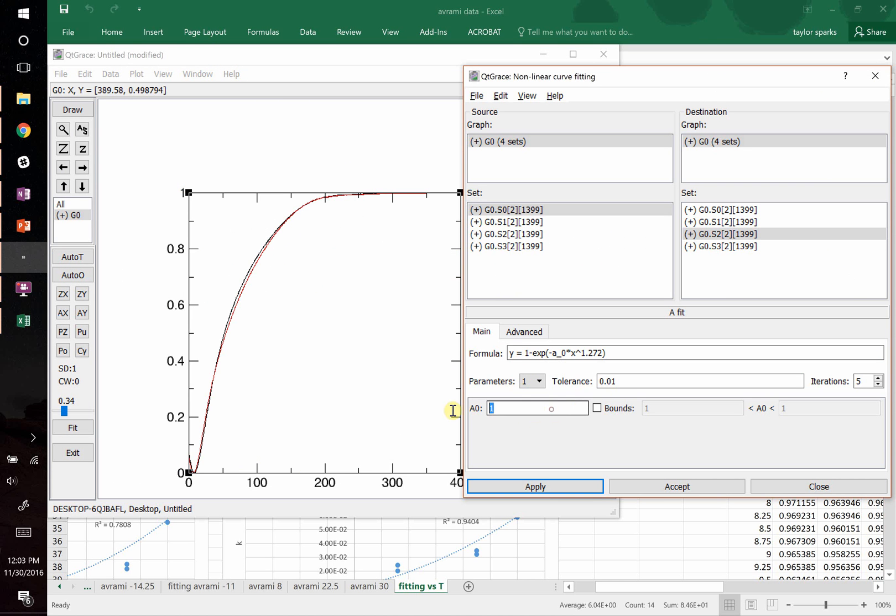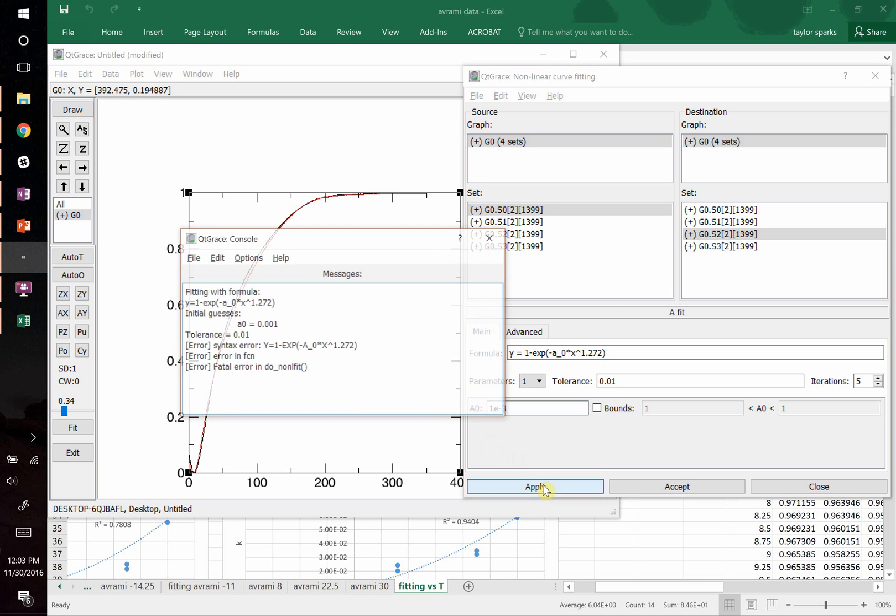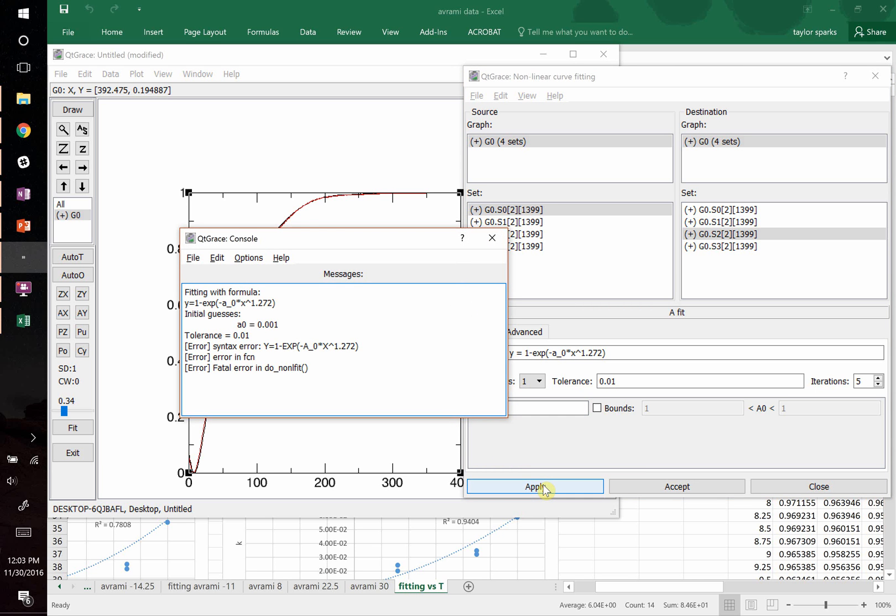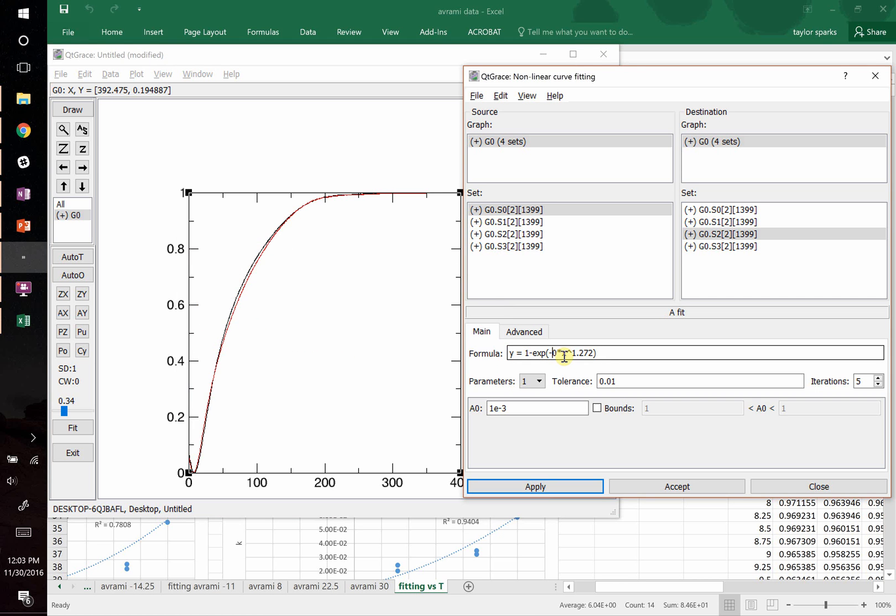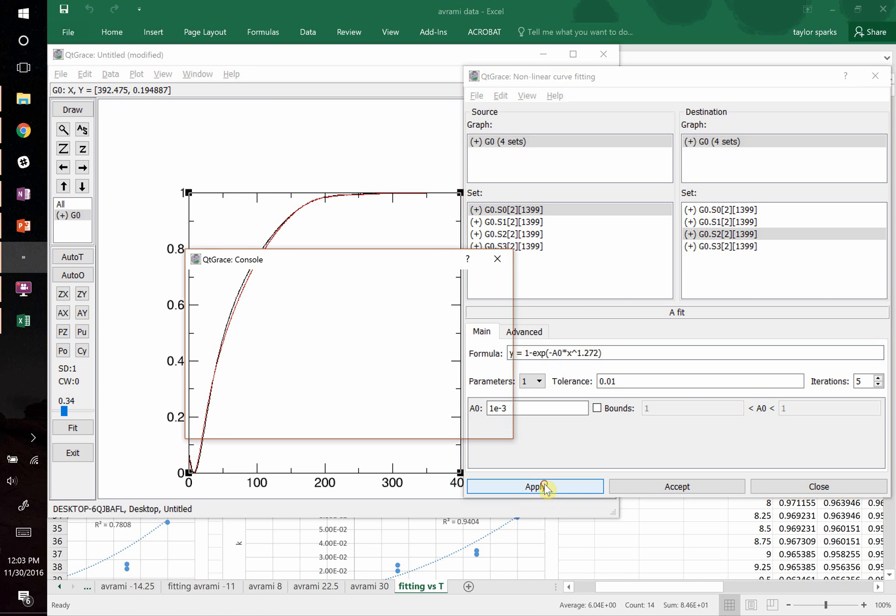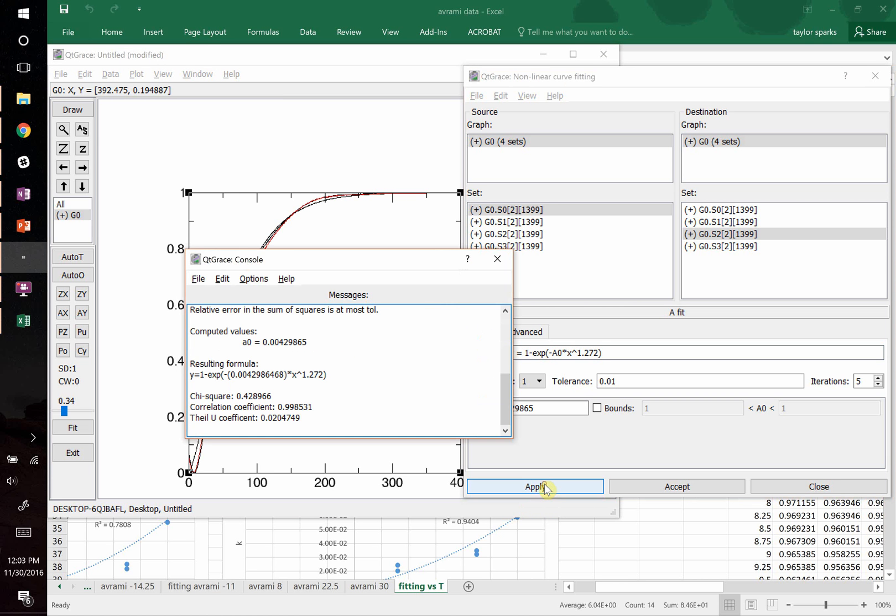So 1 e the negative 3. And let's try this. I think it didn't like our variable name. Didn't like A... I think we have to call that a zero. Let's try that. Let's try this. It did it. The correlation coefficient is 0.998.